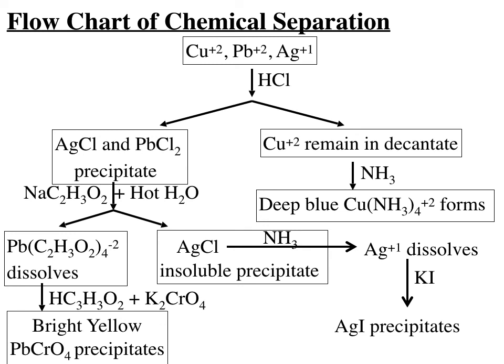What we do then are a couple qualitative analysis steps to verify that what was in the supernatant was lead, because it's clear and colorless before you do the following steps, so you really aren't certain whether or not lead was in the supernatant. And also, if there is remaining precipitate, it could possibly be that you did not complex all the lead, and that remaining precipitate could in actual fact be lead and not really be silver at all.